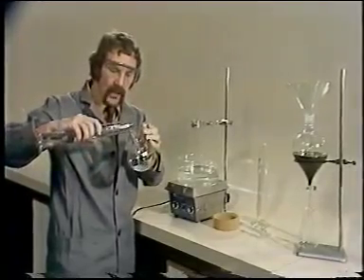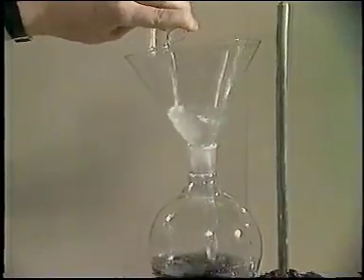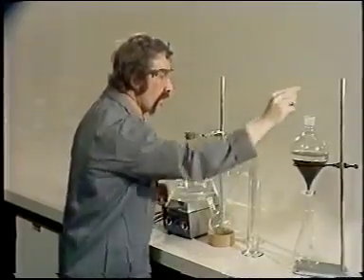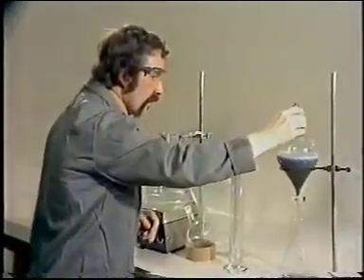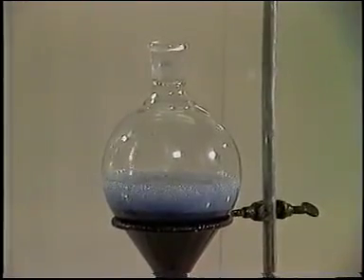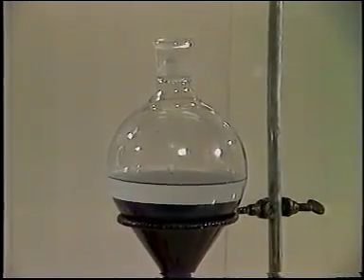Now for the organics. We add an organic solvent, toluene. The two are then very vigorously shaken together. The inorganics dissolve in the aqueous layer, and the organics, including our product, dissolve in the organic layer. You'll see that the heavier aqueous layer sinks to the bottom as the toluene floats to the top. The bottom layer can then be run off.